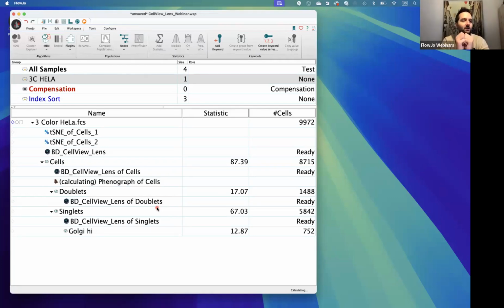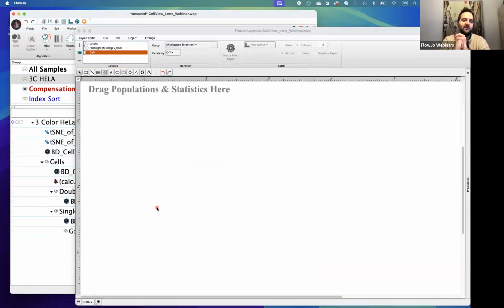We're going to manually select phenotypes that are in close contact, cells that are like doublets but in close contact, and use the nearest neighbors function to find 100 events that look like that. Then we're going to see where this lies on the t-SNE plot and see how we can explore that with HyperFinder further on.